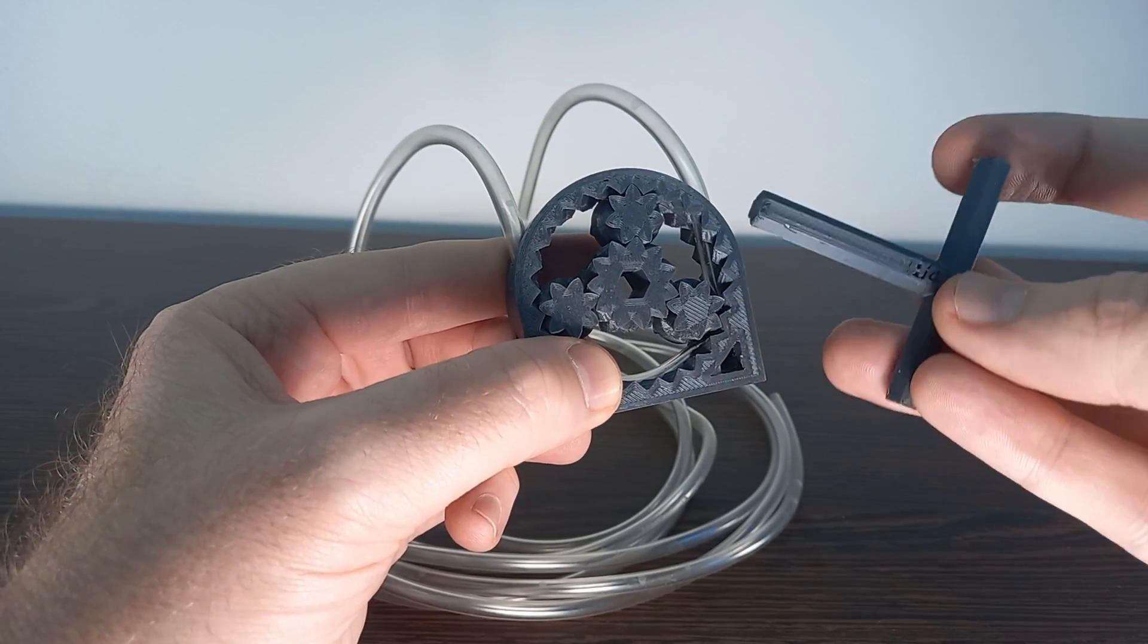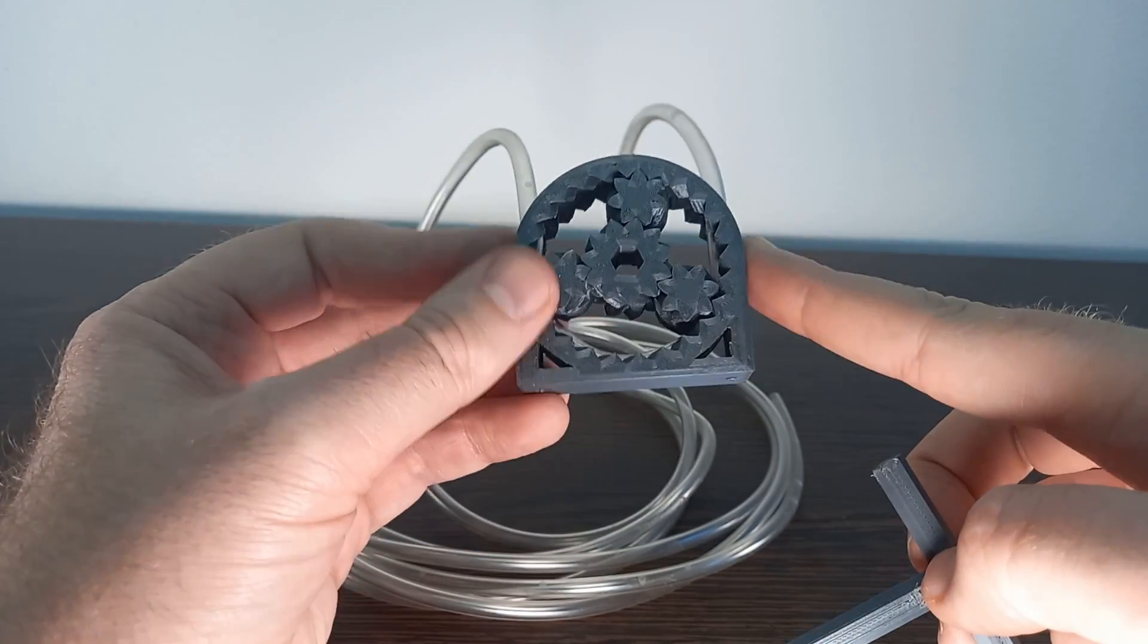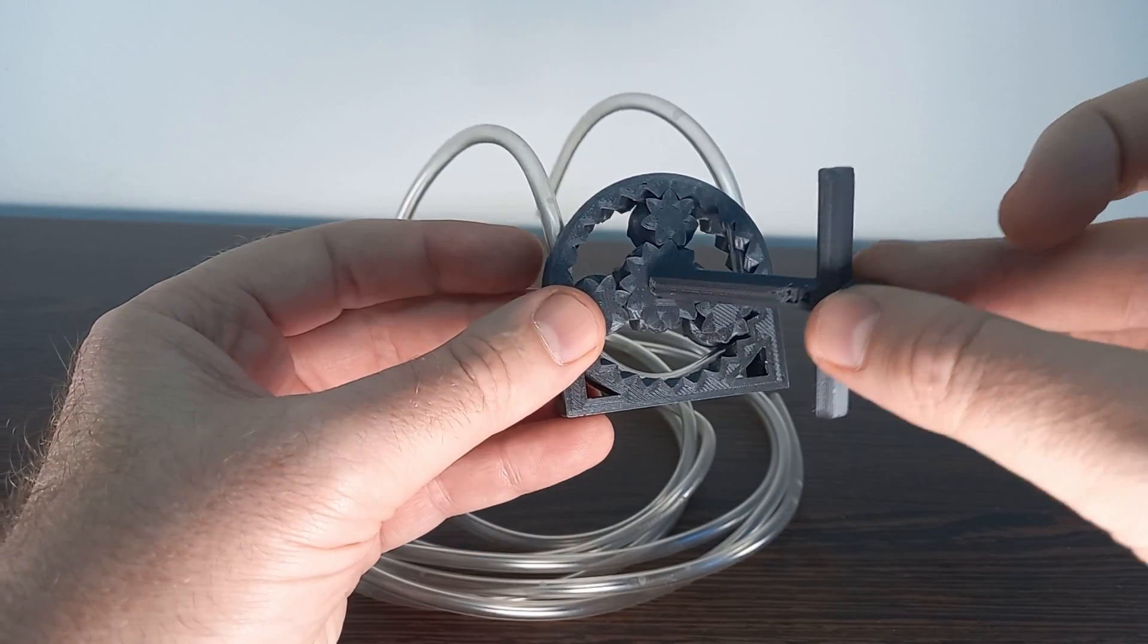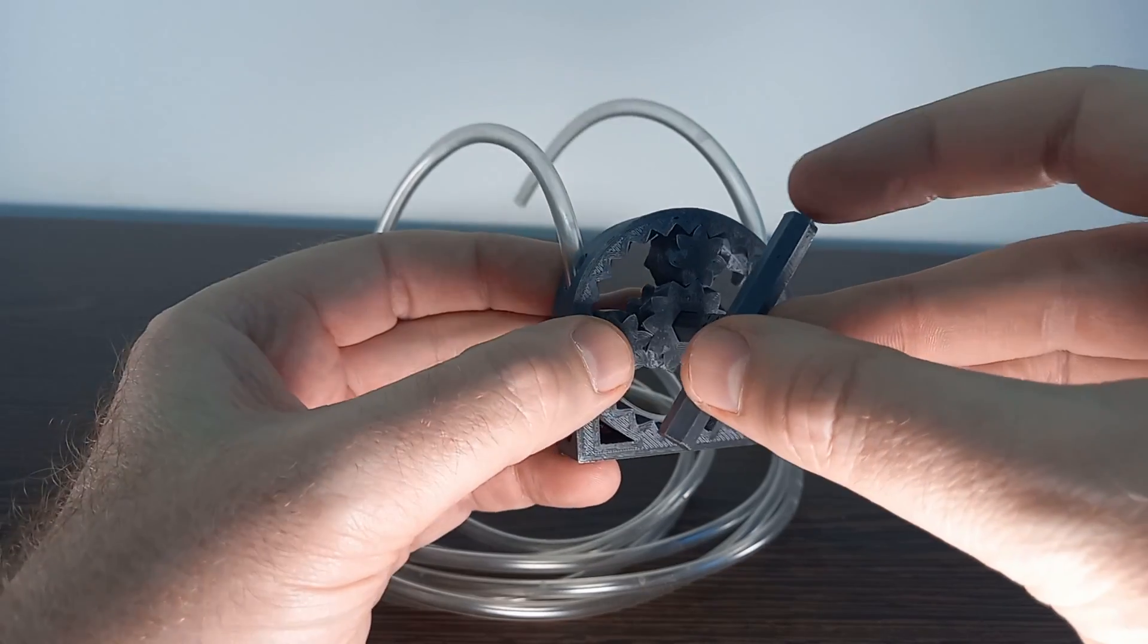So this comes with two parts. There's the pump itself, which was printed as one piece, and then there is this key that will go into the side here.